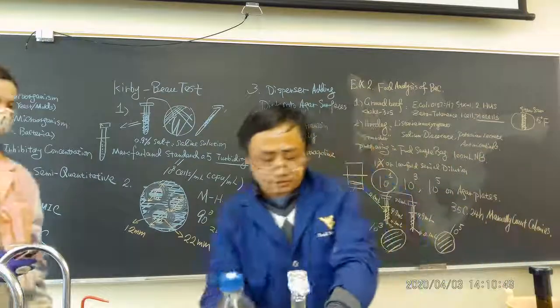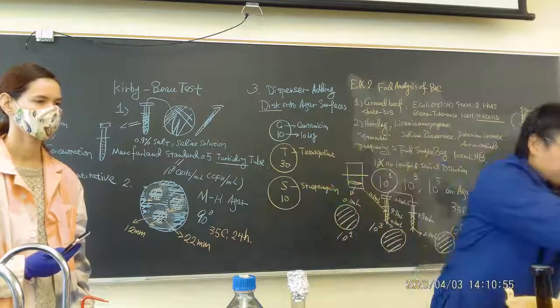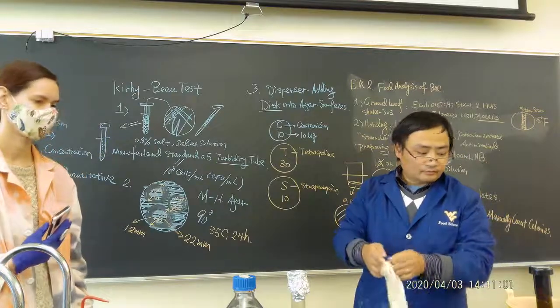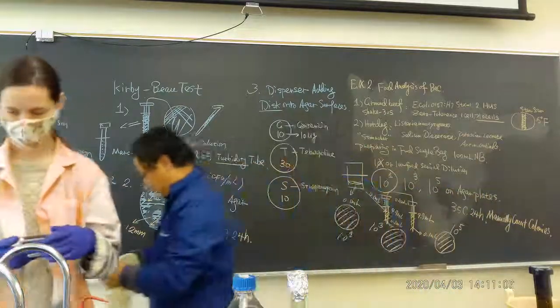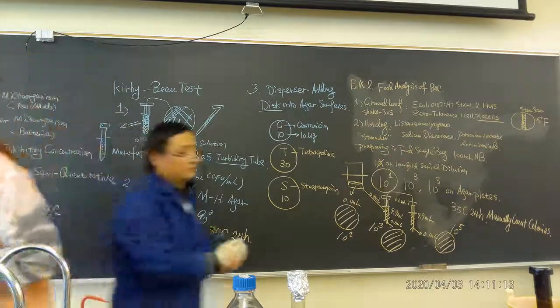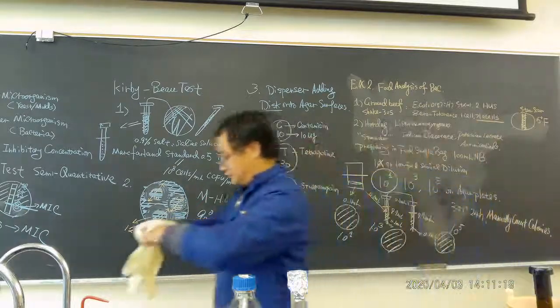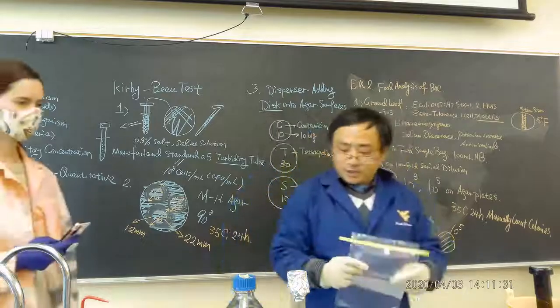This is a nutrient broth. And I will wear the gloves. I have a new one. Okay, let's do these. Do you have a scissor? Okay, that's good. It's not good. This has not been used for long. Yeah, they're not great. That's maybe 5 years. That's why, if you see gloves like this, they have not been used maybe 5 years. So we have 2 different sample bags we'll be using. I mean, you maybe stick with only one. Okay, I don't have that many bags. So this is how we're going to do the sampling.